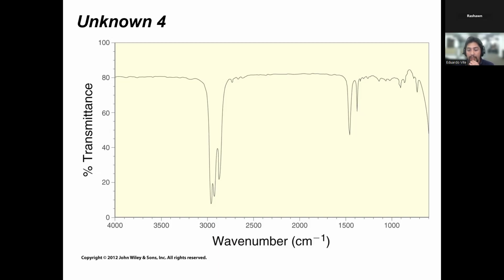So definitely label them. And then the next question was, can you tell us the steps you do when identifying? The steps is you look at the graph, you see the shape, you see the intensity, and you see where they're located. At the end of the presentation, and also just in general, you have a table, and that table tells you where the specific peaks are in the spectra. Honestly, the only real way to get good at this is just to keep doing it. And I'm going to show you guys something like that at the very end as well. So this is really just a matter of practice. The more you do it, the better you get at it.